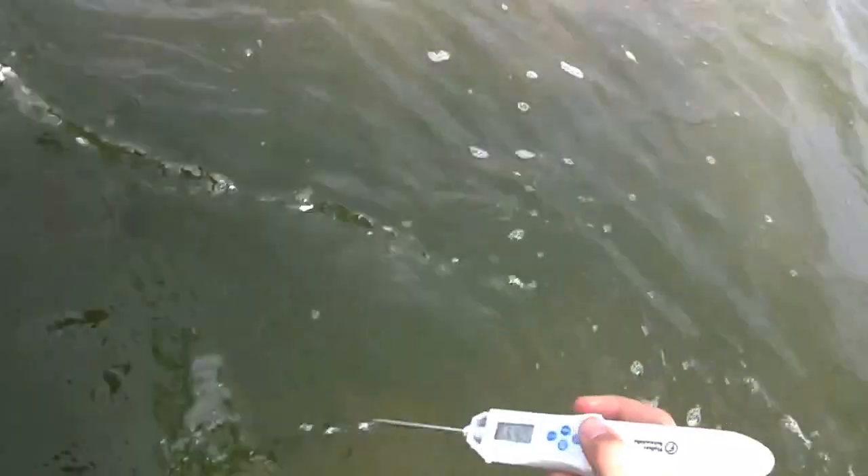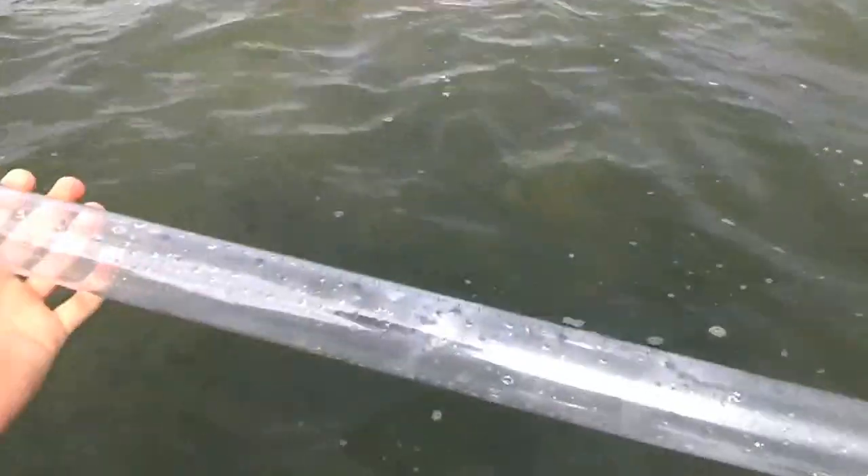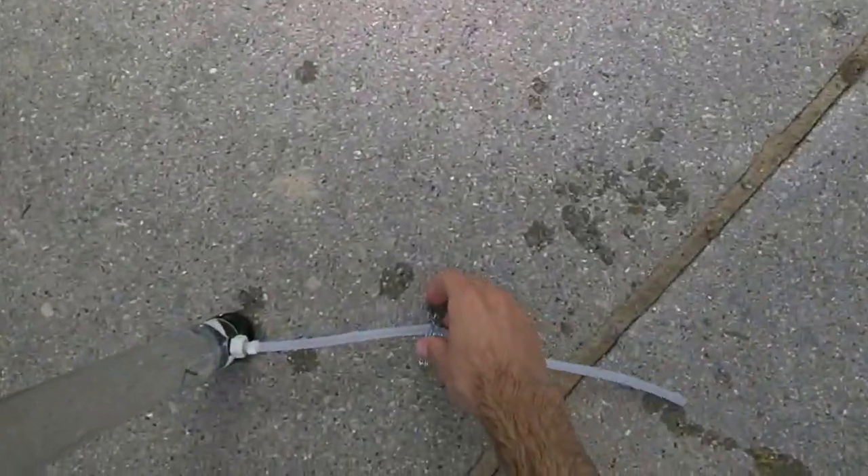We also took a water clarity measurement with the turbidity tube. That involved taking the tube — 120 centimeters — submerging it in the water so the open end is six inches below the surface, letting all the air out, and then bringing that back to the shore. You look through the tube down at the black and white cross pattern at the bottom — that's like a Secchi disk — shading the tube with your body. You let water out of the tube until you can just barely see that black and white pattern.